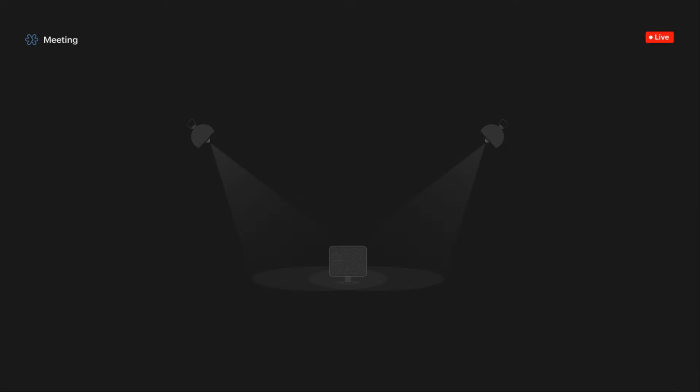The next question is asked by Sagar. He is asking how we determine water sampling point and sampling frequency. Okay. The water sampling point is determined based on the usage of water, for what activity we need to utilize that water. So in that way we are designing.